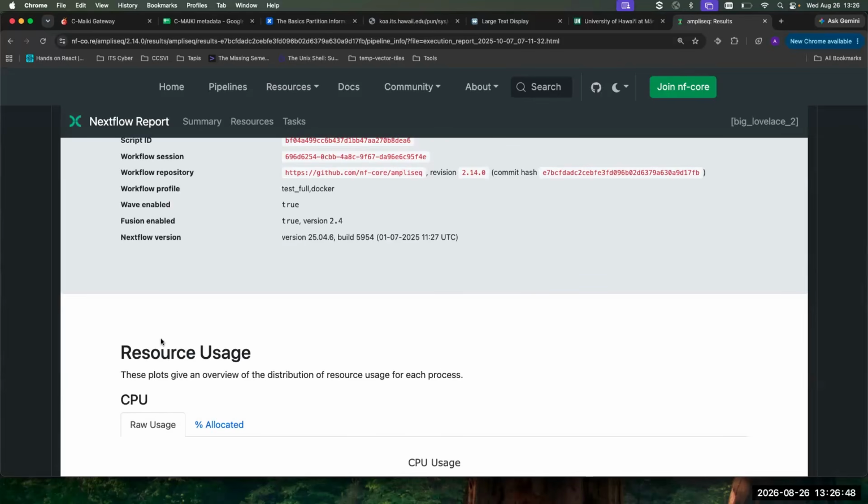So any questions about Ampliseq, how it works? What I recommend you do is if you have a sequencing run that you know how it works, you make a metadata file for it, you upload your sequencing run and your metadata file, and you try this pipeline with data that you have analyzed before. You kind of know how it's going to work. You compare it with your old pipeline outputs. You look at the way the data is output, you already know what it's going to look like. And looking at the outputs from this pipeline, you should immediately see, oh yeah, the pipeline worked really well with data that I already understand.